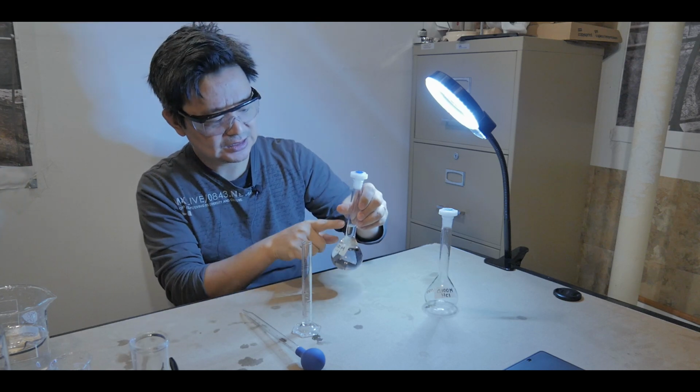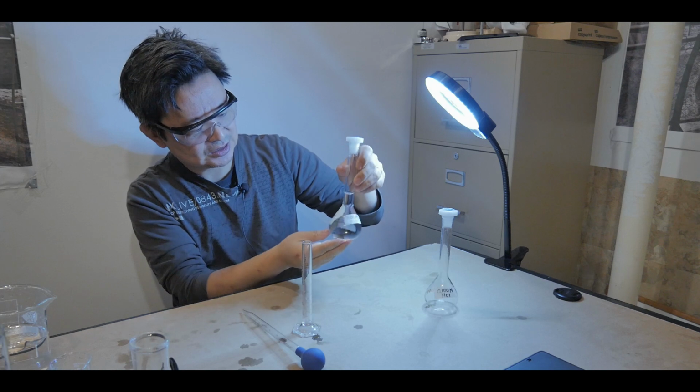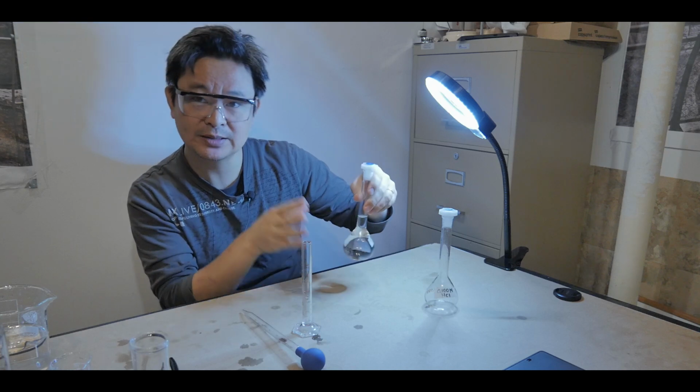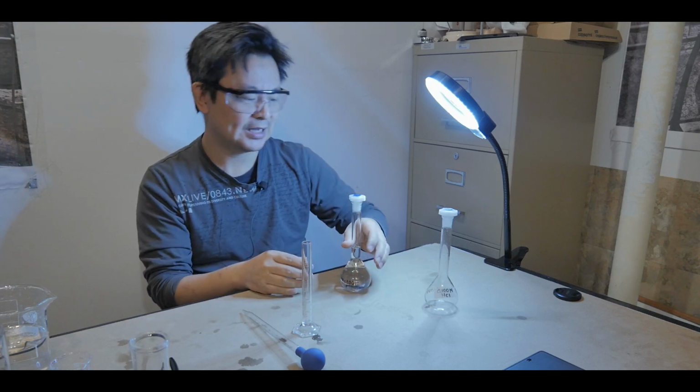So here we see that the marking is right on top. It edges out here and it's telling you that this is exactly 100 mils. Now there is some error, plus and minus 0.1 mil error margin, so quite reliable for that.